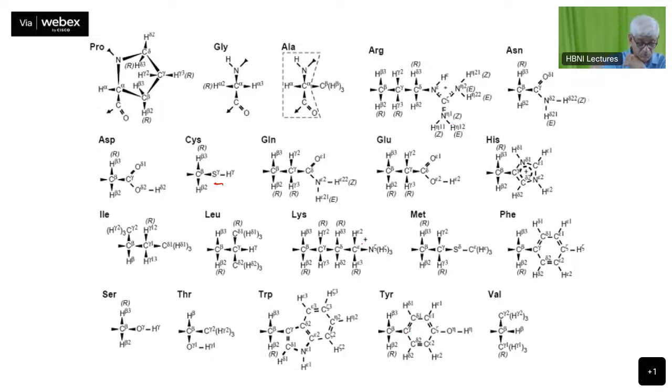Okay, and then you have these aromatic ones. And serine and threonine are 2 unique ones in the sense they have an OH group in the side chain. So the C beta or gamma, and threonine also has a CH3 group over there, the OH and the CH3 group at the gamma position. So these OH groups again provide very distinct chemical shifts for the serines and threonine. And tryptophan has an indole ring, and the indole proton is again a unique one here. This is the indole proton there. So side chain numbering goes in this manner: alpha, beta, gamma, delta, epsilon, zeta, and so on and so forth. So this nomenclature one has to remember all of this. The tyrosine is an aromatic residue once more.